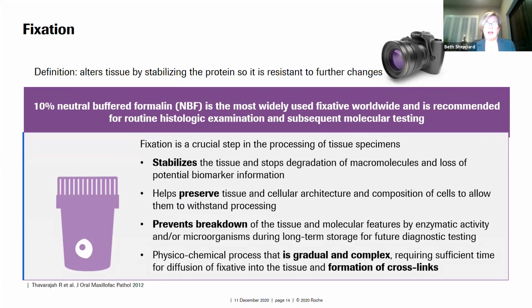By placing it into 10% neutral buffered formalin, which is what is used widely and most often worldwide, it is recommended routinely for histologic examination, mostly because many steps that happen after the H&E, such as molecular testing or immunohistochemistry testing, are all based on neutral buffered formalin and not any other fixative. So that's validated against samples that were fixed in formalin.